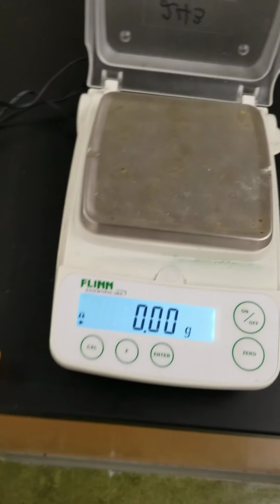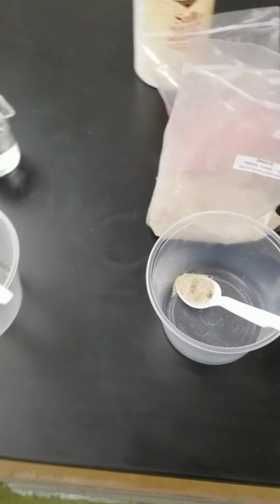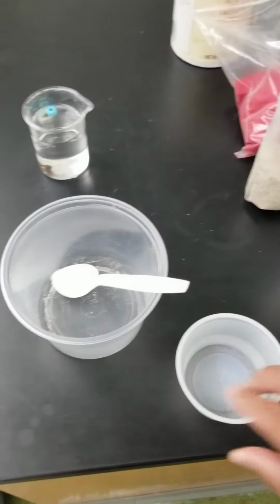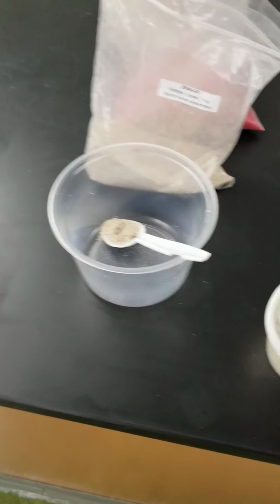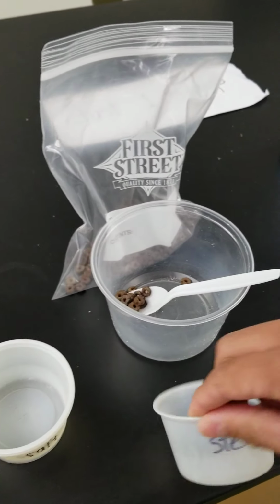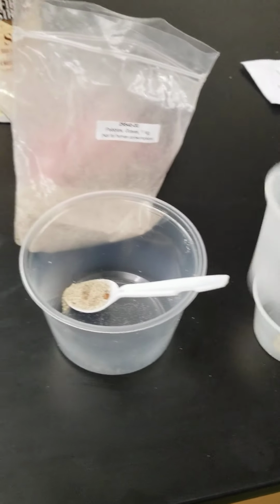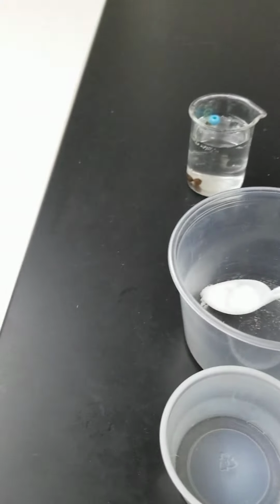Okay, so the next thing we're going to have to do is start measuring all of these substances. So we have our, let me put this in the correct order, sorry, pebbles, pop beads, steel nuts, sand, and salt, making sure that I have everything placed in the right spot.